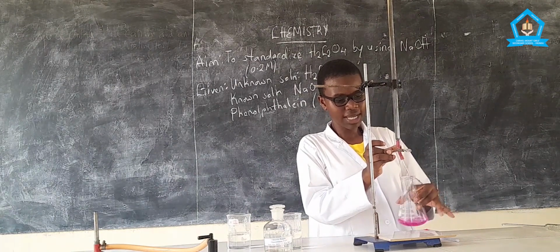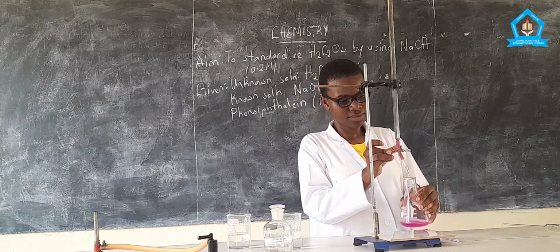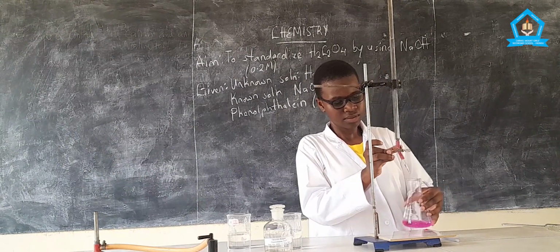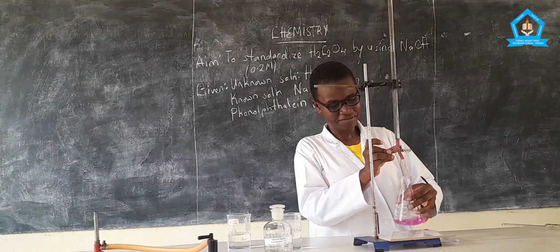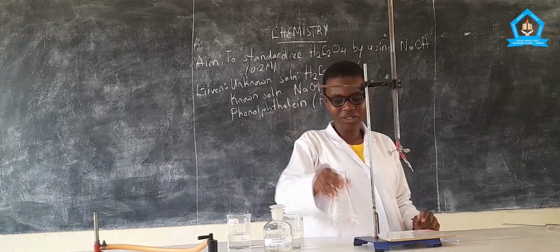You have to shake your mixture. You have to be careful during the mixing. There we go. We have our solution.